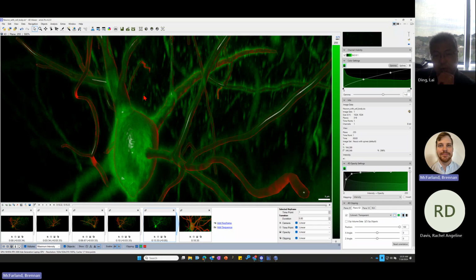This would be nice to show everything, like if you're doing this colocalization we talked about Tuesday, and if you had objects that were overlapping with each other, it's going to be hard to see them if they're both rendered at the same time in the same opaque setting. So using this glass feature, clipping, and all of that helps you have that creativity to show the data how you want, turn on some objects, turn some off, emphasize the insides of these, whatever's inside this tracing here.